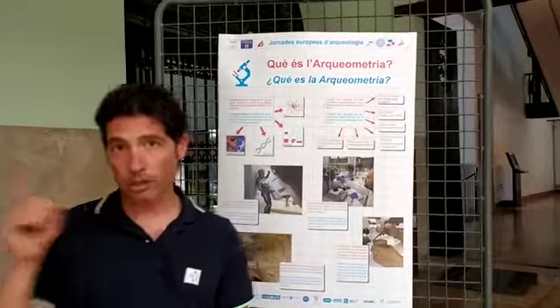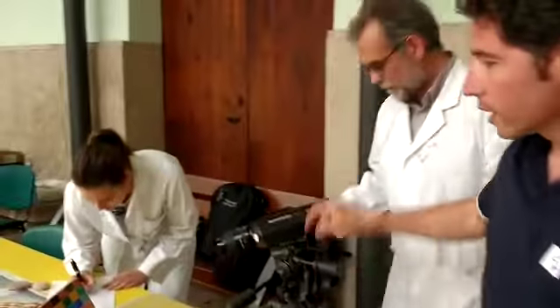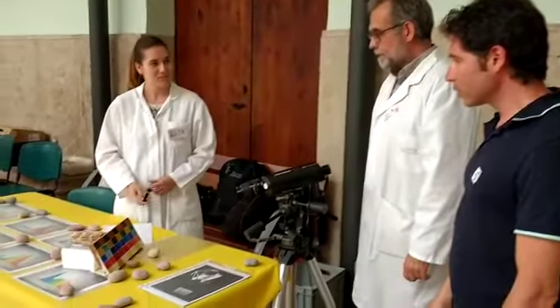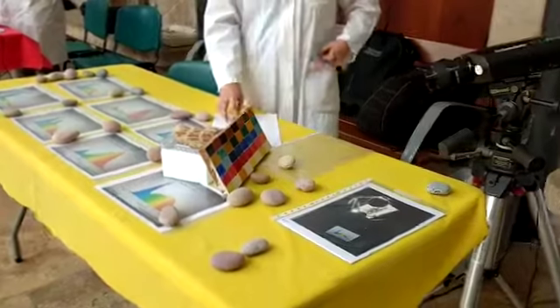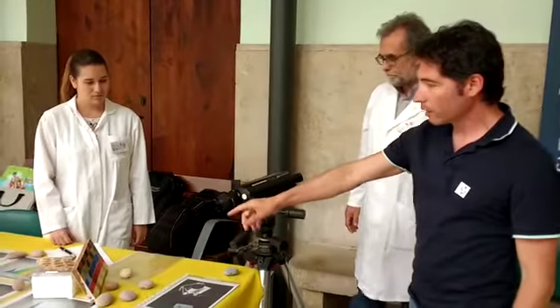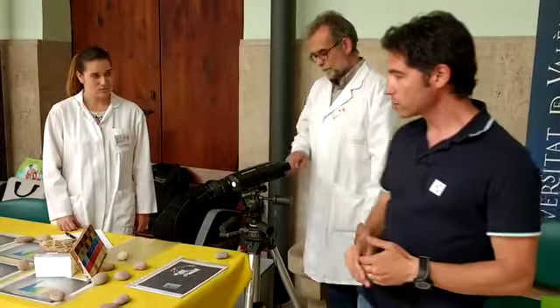Now we are going to our instrument. Here you can see a colorimetric instrument, and here Angel is going to show us how it works. Here we have a table of color, and he is pointing to a color, and this can tell us about the grade of color that you can find depending on if it's red or blue tones, different tones.